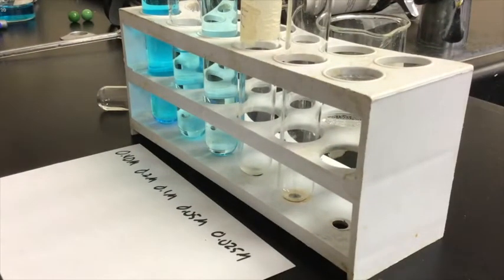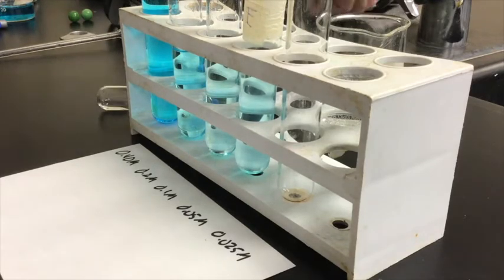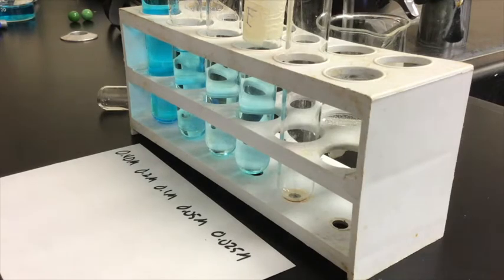So now the next step is to take 10 of the 0.1. And if you take 10 of the 0.1 and put it in this guy here, now I've got 10 of the 0.1 molar solution. But again, I'm going to make it easy on myself and cut that guy in half by taking 10 of water. And there's 10 of water.